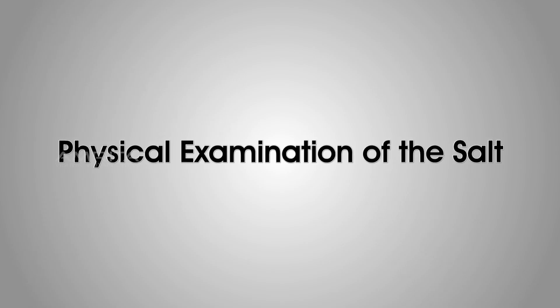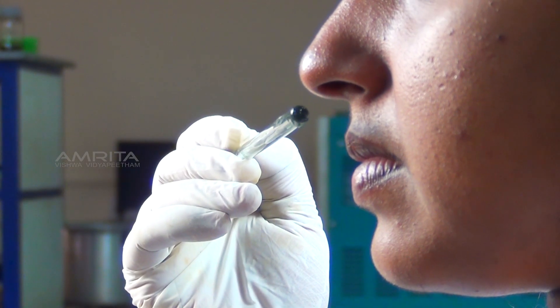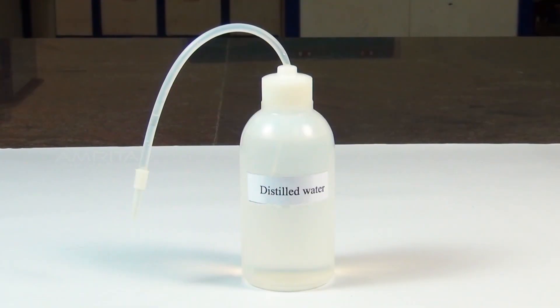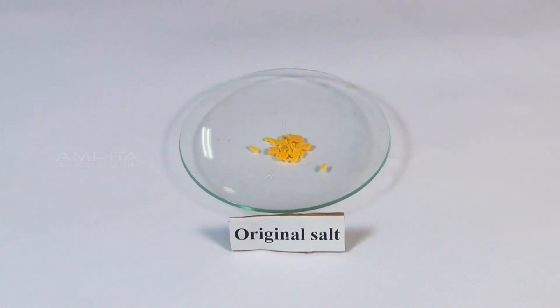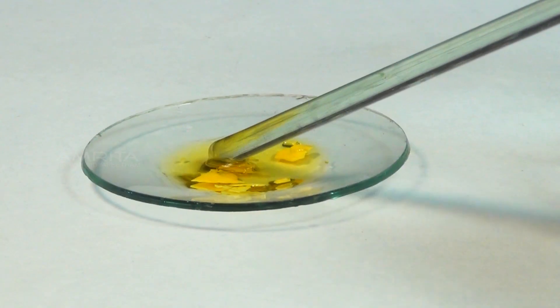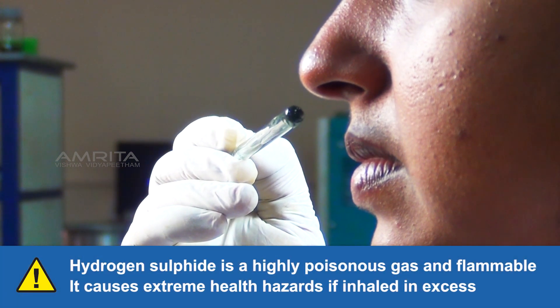Physical examination of the salt involves the study of smell. Materials required: a small quantity of the salt in a watch glass, distilled water, and a glass rod. Procedure: Take a pinch of the salt in a watch glass, add a few drops of distilled water, then rub the salt with the glass rod and smell it. A rotten egg smell indicates the presence of sulphide.